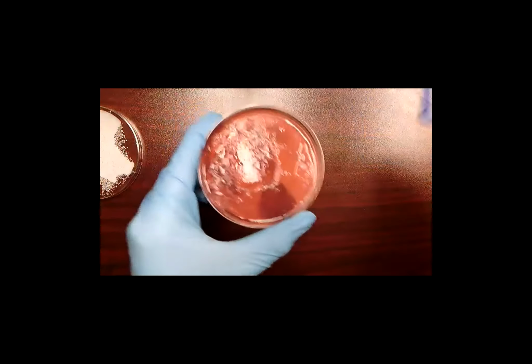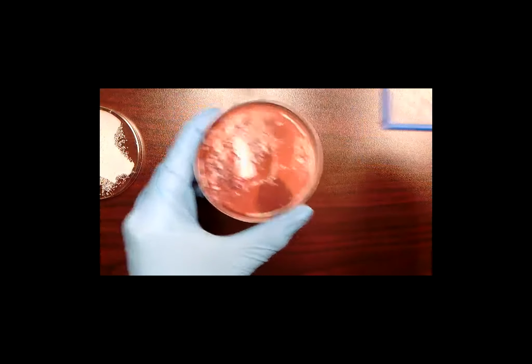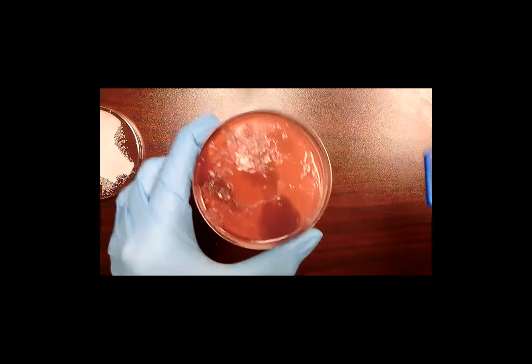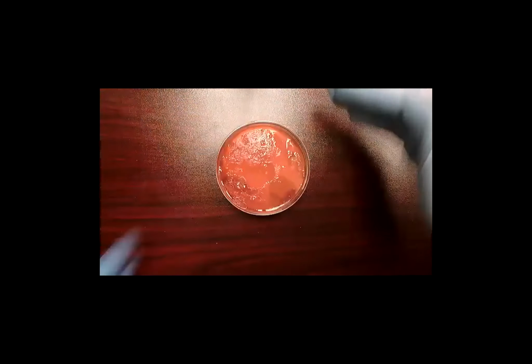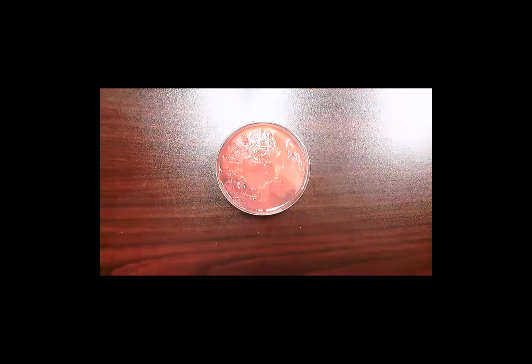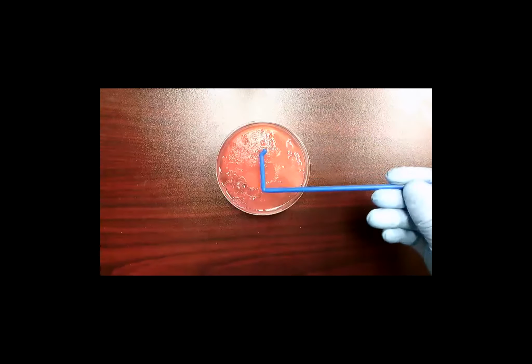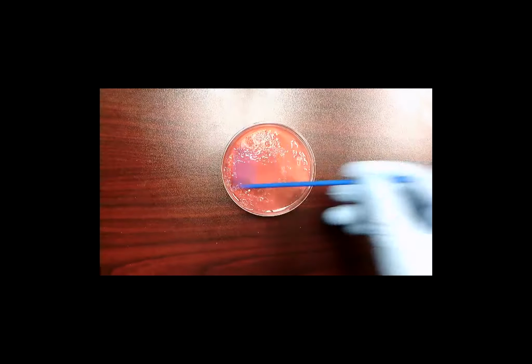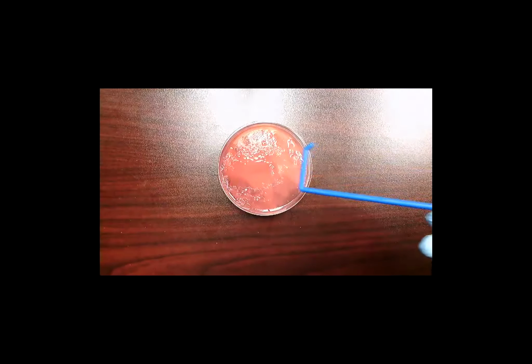So one of the things, if you watch the YouTube video, in a lab, they would take this agar plate and put it on what they call a turntable, which is basically a circle, and it sits down in it. And then they take their hand and they spin it. And then as that Petri dish is spinning, they take the spreader and they just go back and forth like this while it's spinning, and that helps it become very even.